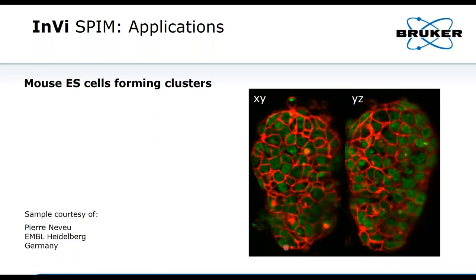You can see that we have a very good lateral resolution in XY, but also the axial resolution is very close to the lateral resolution. That's another advantage of light sheet microscopy. When you make the light sheet very thin, which defines the Z resolution, you can obtain very close to isotropic resolution. Nevertheless, you might see some striping, and some deterioration of the signal when the light travels through the sample.